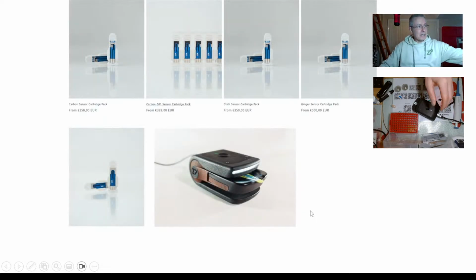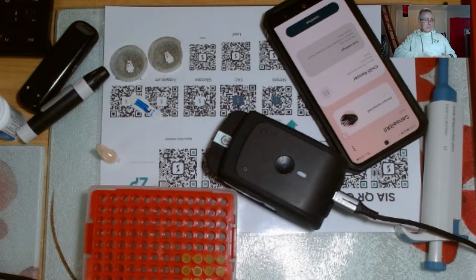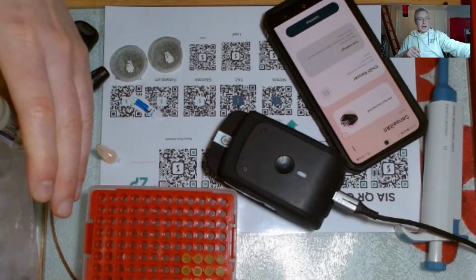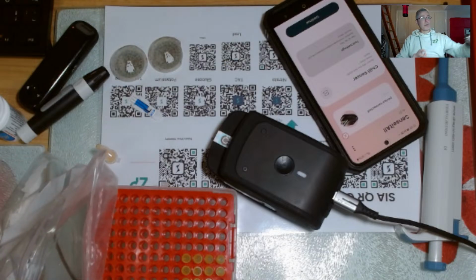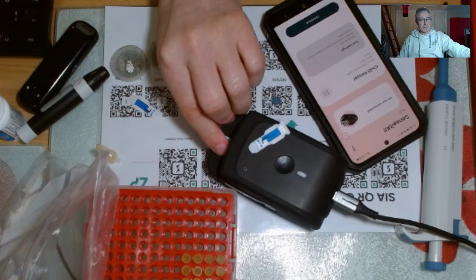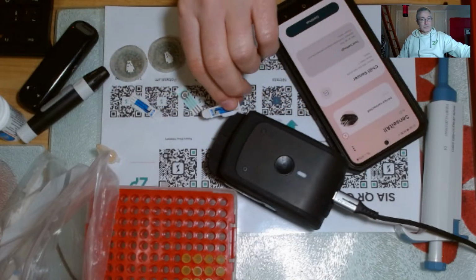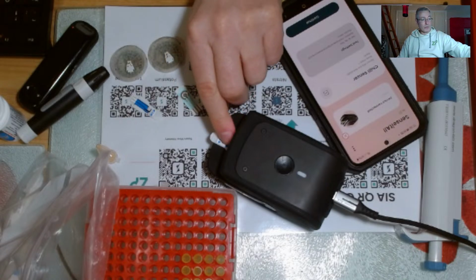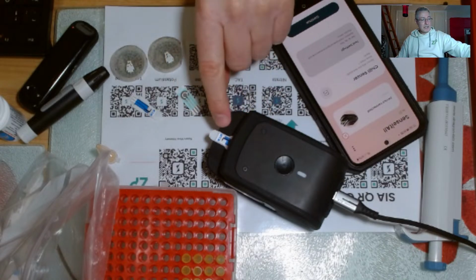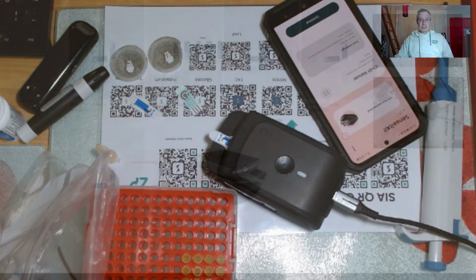I just want to say that at ZP, I will be supporting in today's webinar some data that's coming off non-ZP potentiostats. I think with time we will harden up on this a little bit more and only support our own potentiostats. But for the time being, at least in this webinar today, I will be supporting other potentiostats, in particular because they are using screen printed electrodes from ZP.